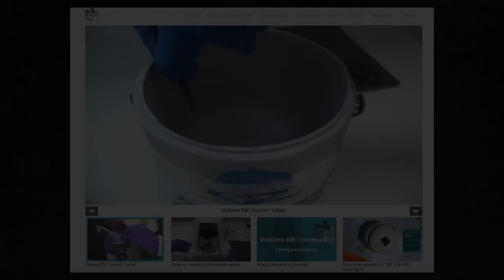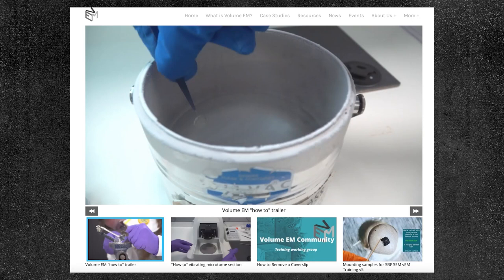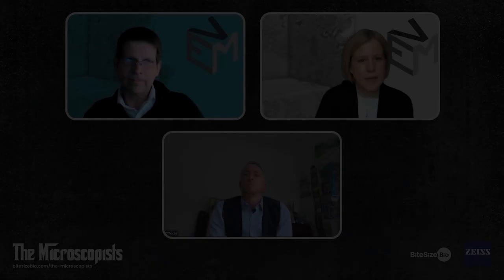And there's also a load of movies. So there are clips and movies that you can go to. Where can you find this information? So this is all on the Volume EM website, and there's a page for training movies. Again, this is the training working group who've been making some fantastic videos. But Kirk, you're going to be carrying this on, aren't you? Yes. So we'll be adding to the great starting content there now. And again, volumeem.org.